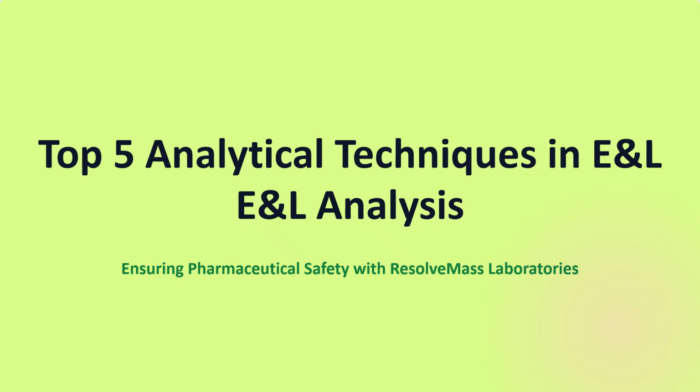These compounds are known as extractables and leachables, or E and L. Even trace amounts of these substances can affect drug safety, stability, and regulatory approval. This is why pharmaceutical companies perform detailed E and L studies to detect and identify these potential contaminants. In this presentation, we'll explore 5 key analytical techniques that scientists use to detect extractables and leachables and ensure the safety of pharmaceutical products.